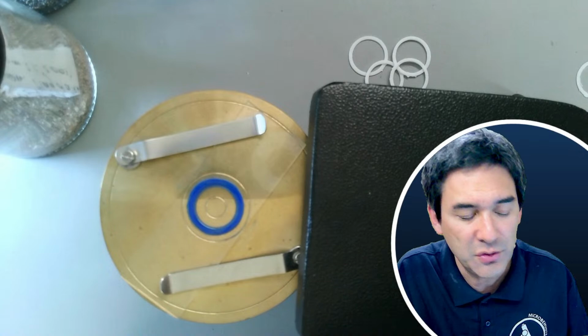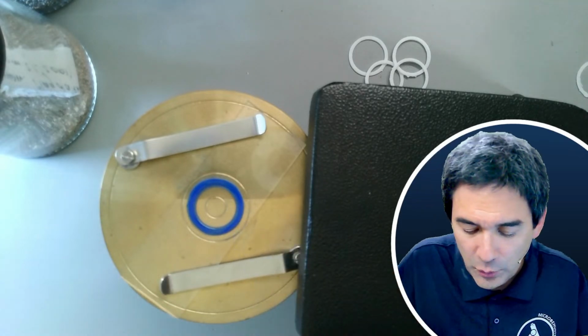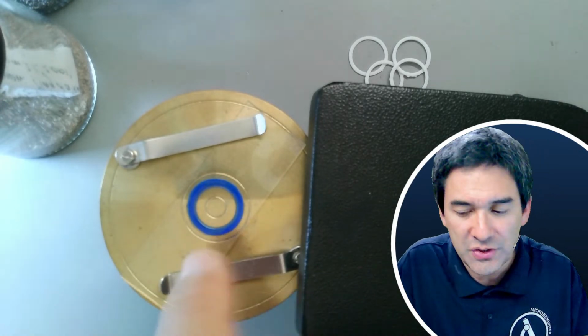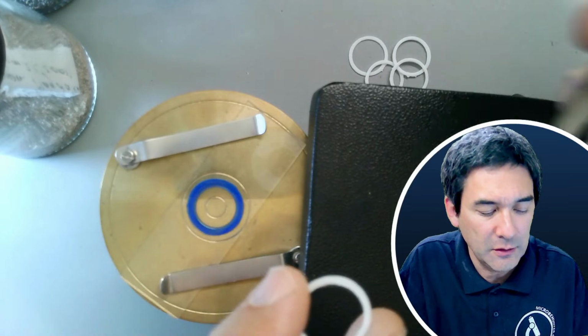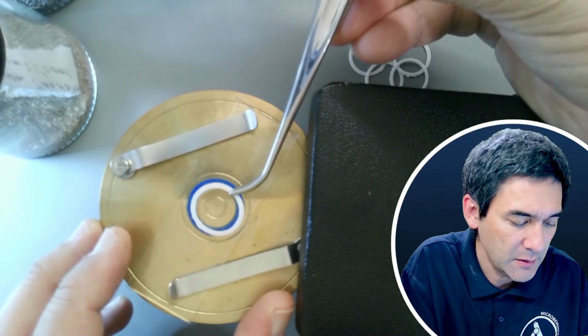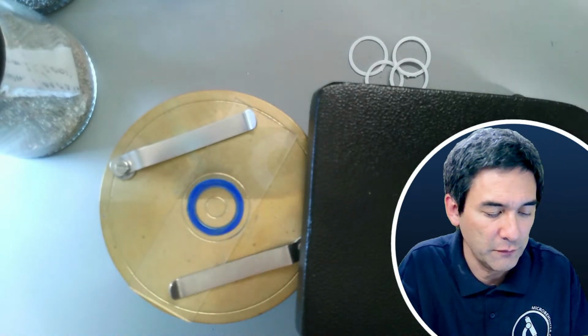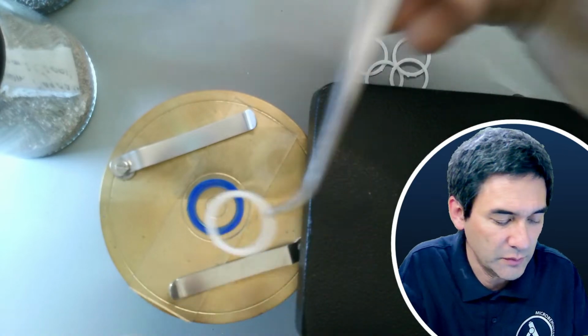However, what I want to do now is the following. I'm going to leave it like that, and I'm going to try to use this now, not as the spacer itself, but as the glue to add a spacer ring. Let's use the rough surface to the bottom. Okay, I think that's the rough surface. That's correct. The smooth one is on top.